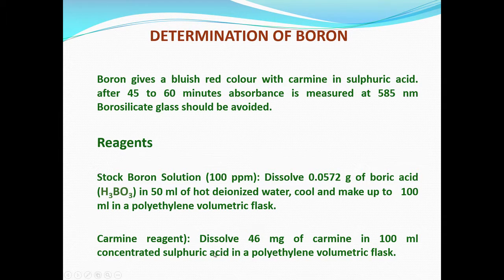So, if you take 46 milligrams, that is 0.046 gram of carmine in 100 ml of concentrated sulfuric acid, that too again you should use a polyethylene volumetric flask, and it will dissolve and give you a reagent.